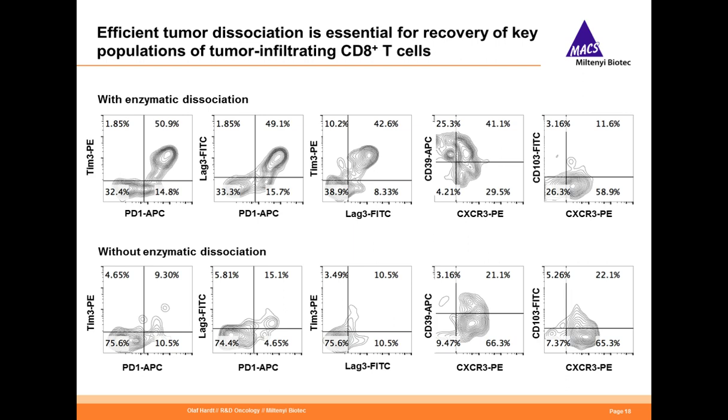So the last aspect concerning the dissociation of this viable tissue is actually pretty surprising, because there are always some approaches to do tissue dissociation purely on a mechanical basis in order to avoid any epitope stability issues. So meaning that when you do not use enzymes, the enzymes cannot harm your epitopes.